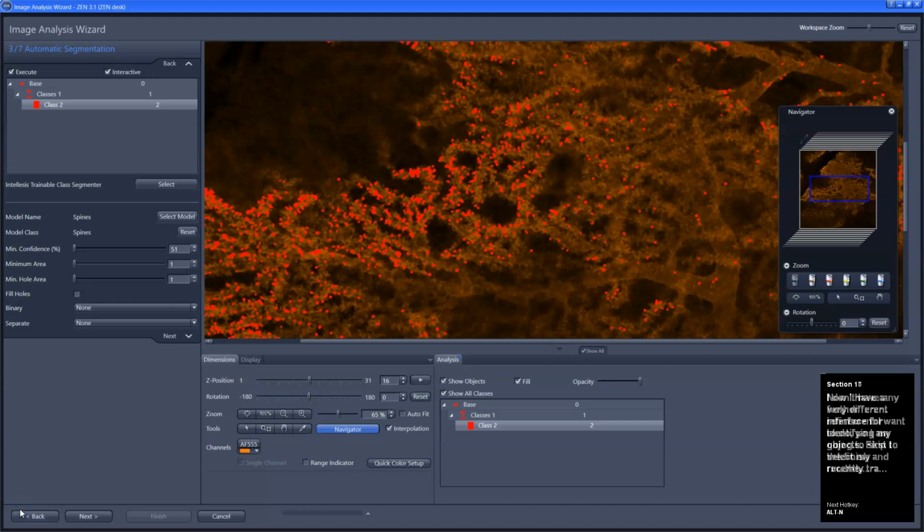I don't have any further refinement I want to do in this image analysis, so I'm going to skip to the finish and run the analysis on the full dataset. The processing will then be performed on each slice of the stack with the final data output including a table for the field properties that is by default the object count in the image. Keep in mind again that this analysis may take tens of minutes. Here I'm only showing you the final results.